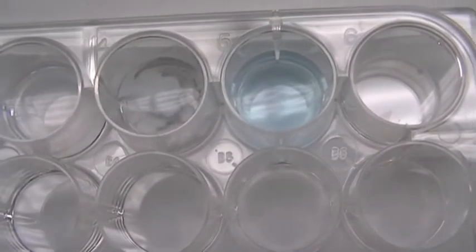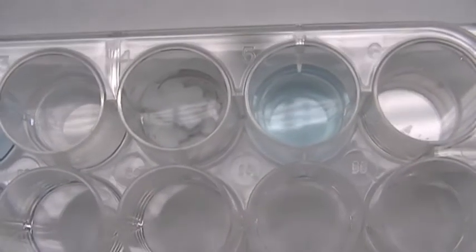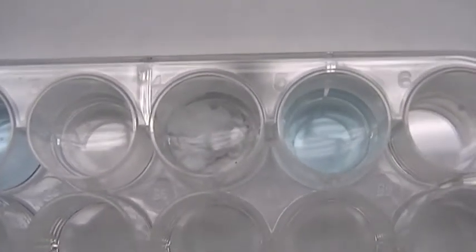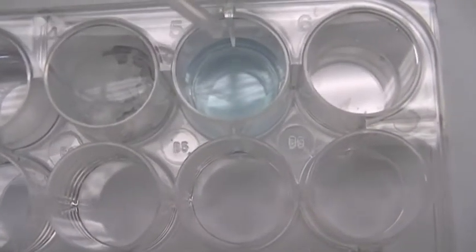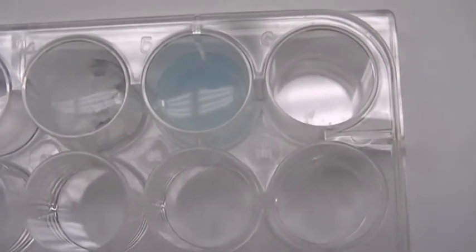All right, so again, you should see the white precipitate that formed when that hit that solution. And then the last one is copper nitrate with 1 drop of silver nitrate. Let's see if we can see anything happening in here. Again, you do see some precipitate.